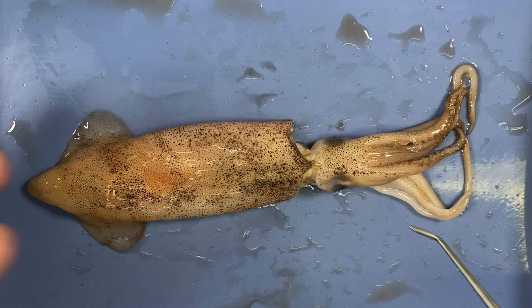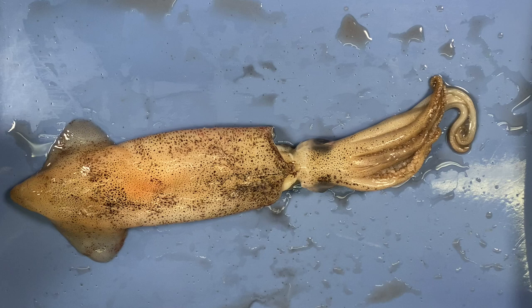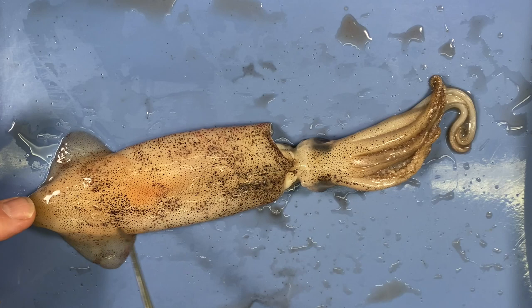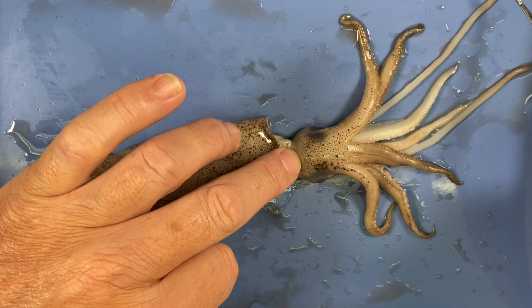Squids have fins, which are used in locomotion and to steer the animal. Looking at the two main body parts externally: this part of the squid is kind of an open-ended sack — this is the mantle, and inside is the mantle cavity. This part of the animal with the head includes the arms. You can see these long ones are the tentacles.